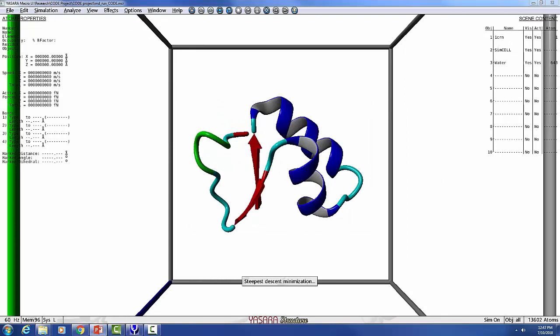analyzing this protein. This is a process that will take quite some time. It may take days or it may take weeks to analyze a protein depending on its structure and complexity. So you would run this and let it go, and it'll run different steps of this code. Don't try to move things around because that changes how things work here.